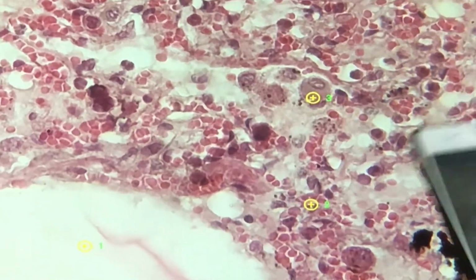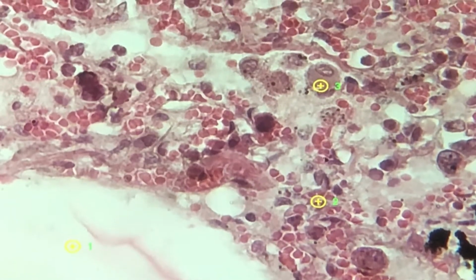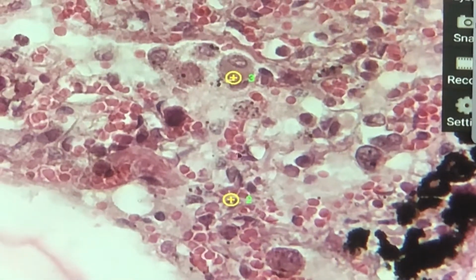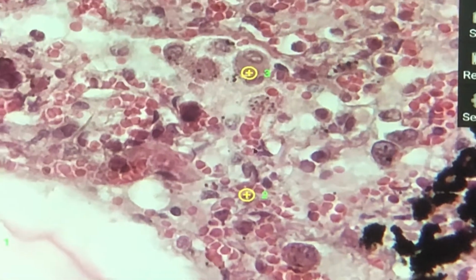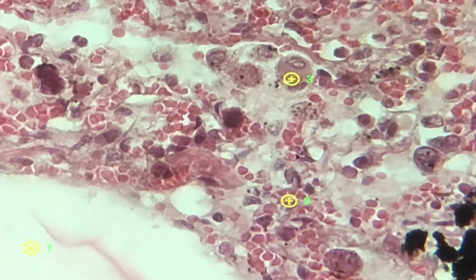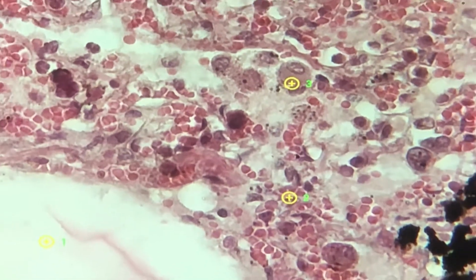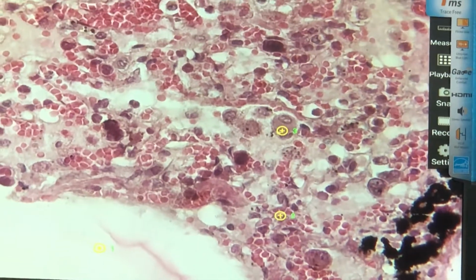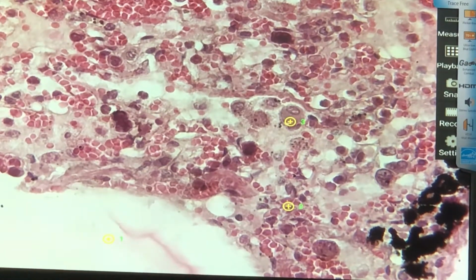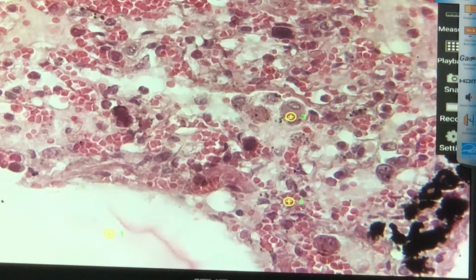When you see that one, the hallmark, big smile, do not guess another diagnosis, make your diagnosis: chronic passive congestion of the lungs. Hemosiderin-laden macrophages, you see those inside? Actually, the color here is poor because this is medyo violet and red. In the microscope it is colored golden brown, which is why you have to scan this in the microscope. Few students who scanned on Monday in the microscope independent study saw this as golden brown, especially in a high power objective.